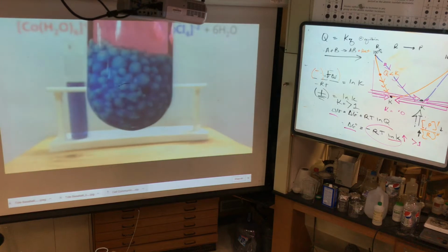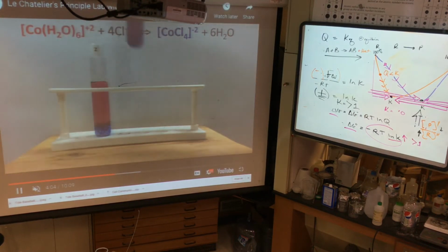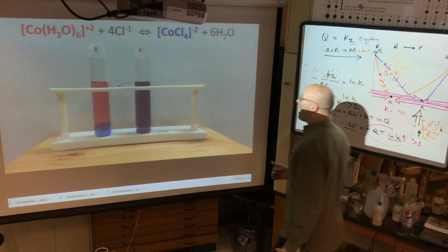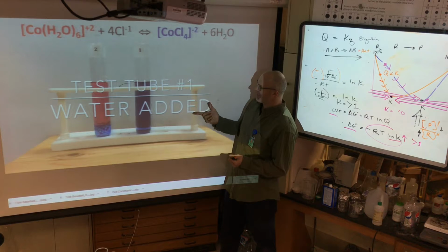All right, moving forward. It's enough. Okay, now, I'm going to start with blue. In this test, I'm going to add some water to this. This is not the one I wanted to do yet.